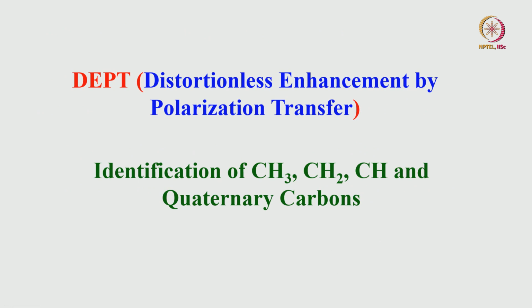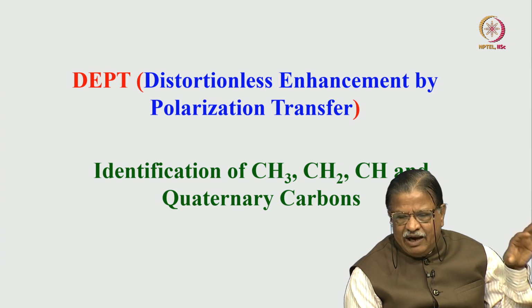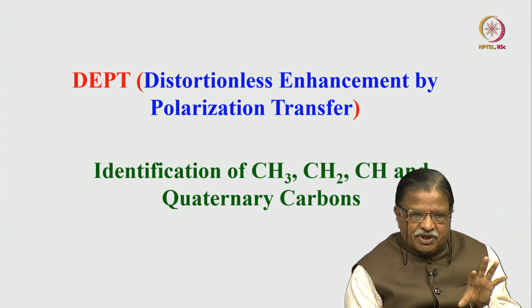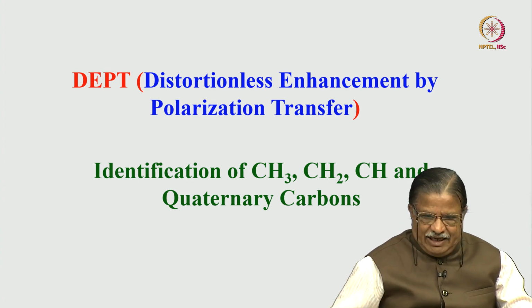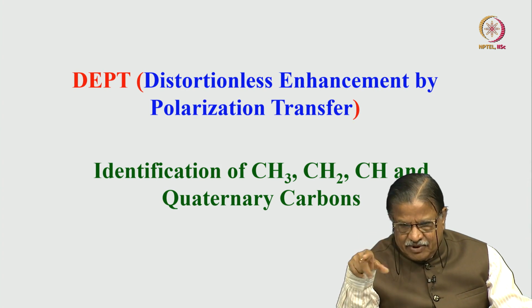Going further, I want to tell you one important experiment called DEPT. This involves what is called a polarization transfer. As I said yesterday, polarization transfer I am going to discuss later, because I have not discussed this polarization transfer and NOE, which I introduced yesterday while doing the decoupling NOE factor. I said these two terms I mentioned but not discussed in detail, which I am going to do in next class or subsequent classes.